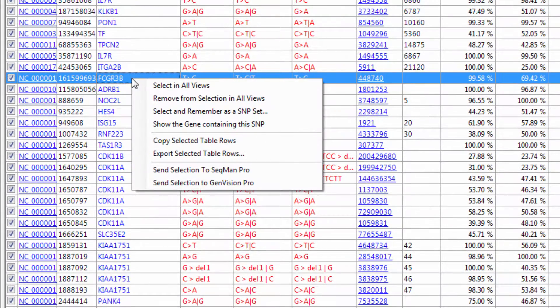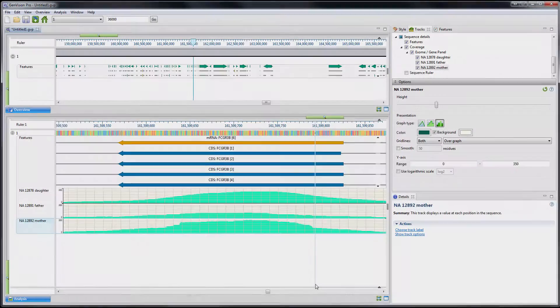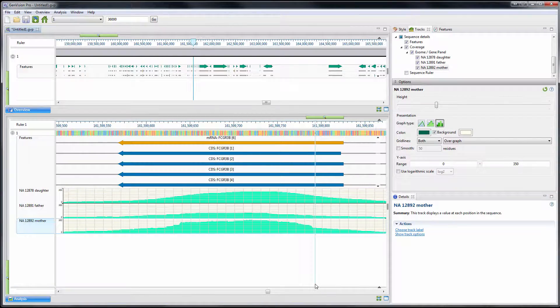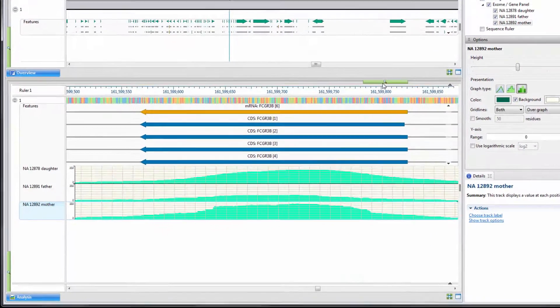I can also send my selection to GenVision Pro. And within GenVision Pro, I can view the assembly coverage for all of my samples simultaneously.